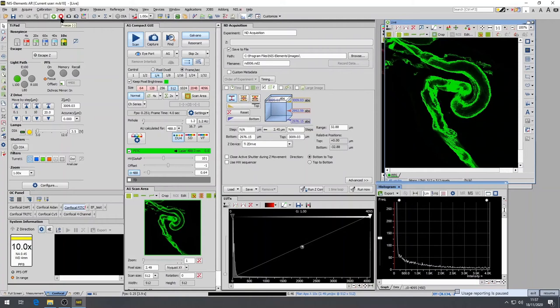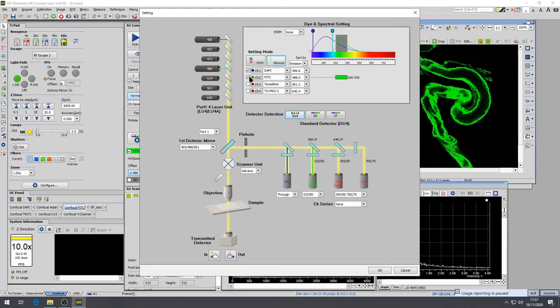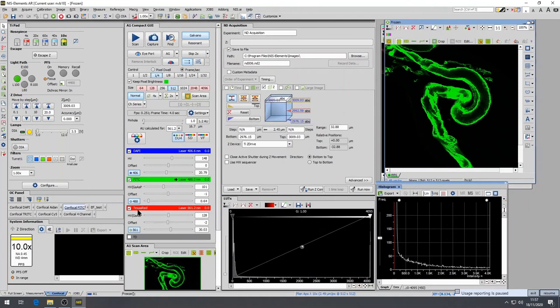At this point, you want to reactivate all the relevant laser lines that you would like to include in your multi-dimensional acquisition combined with Z-Stack. And then check the parameters of the Z-Stack before you start the experiment.